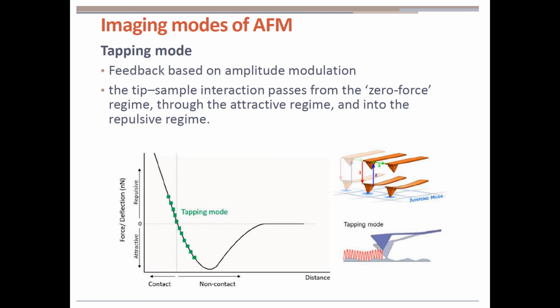Besides, the duration of this direct contact between tip and surface is much shorter, so tapping mode imaging will not damage the sample surface. It is gentle enough even for the visualization of soft surfaces, such as supported lipid bilayers and adsorbed single polymer molecules.